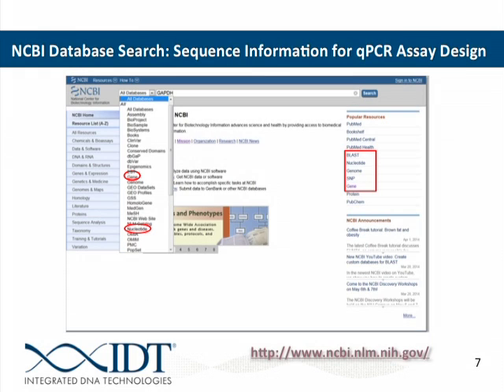So to begin, we can go to NCBI. This is the NCBI homepage. We can search for our gene of interest. You can either input your gene of interest by name here, or by accession number if you know that. And you can search by either the gene database or the nucleotide database. And so we'll look at some of the different outputs from these shortly. And then you can see also on the NCBI landing page easy access to all these other databases that we will be talking about in terms of qPCR design. Your BLAST search, checking for SNPs, and so on.